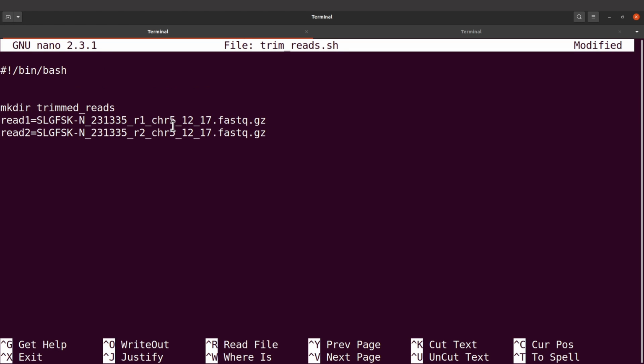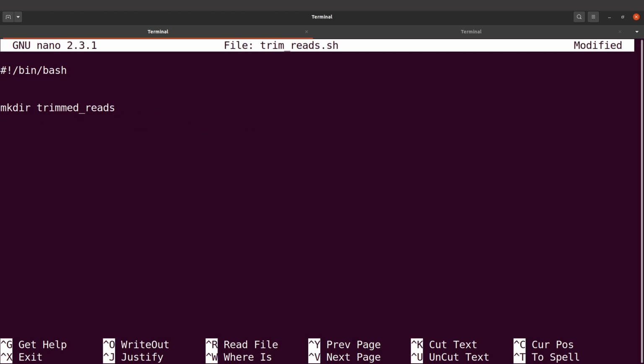All right, so we have them done. Okay, now there's something else we need to also do. I'll even go over again. I think it's better that way. There's something we need to do first. I think I omitted it and it's important.